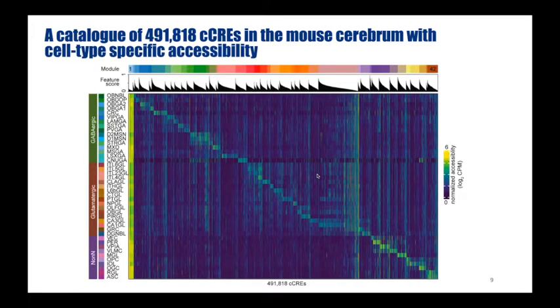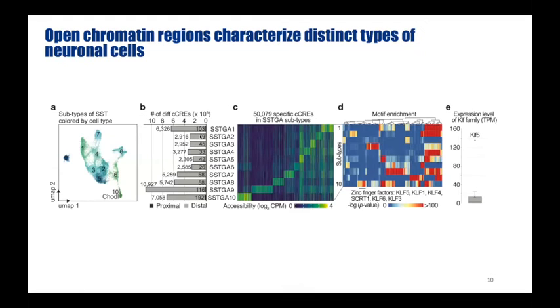So using those candidate cis elements we find, you can really ask several questions. You can simply download the data from our web portal, and you can also download the results from the differential analysis we did previously. I'm just showing you one example.